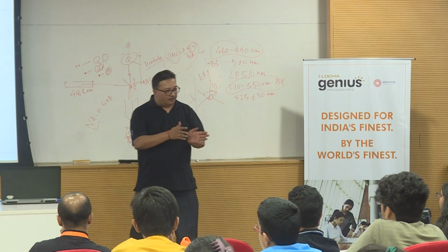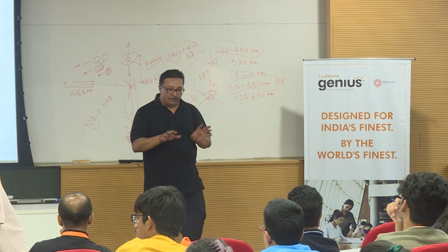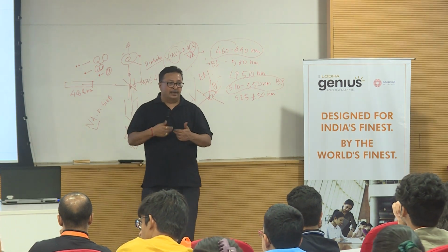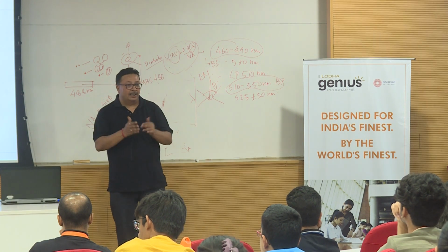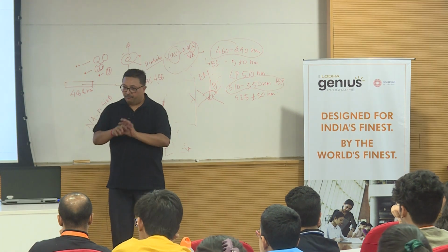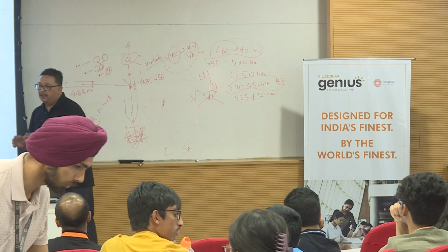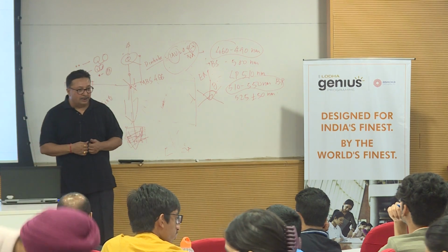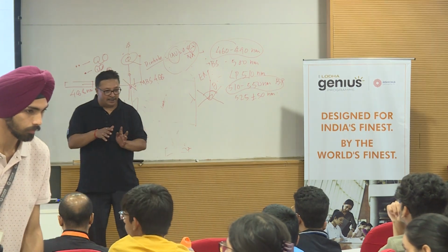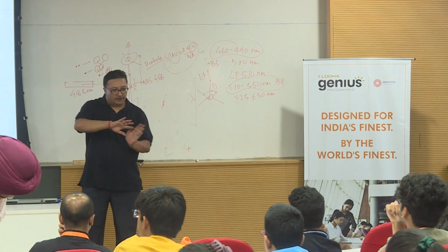It can be 2D versus time, a time lapse, if it is a live sample showing some abrupt changes, like vesicle transport happening. I can record it, I can image it as 2D versus time, a time lapse image. If there are multiple fluorophores, because in one sample I can have a green tag, a red tag, and a nuclear staining which is a blue tag, so multiple wavelengths, then X, Y versus time versus lambda. X, Y with Z, with time, with lambda.